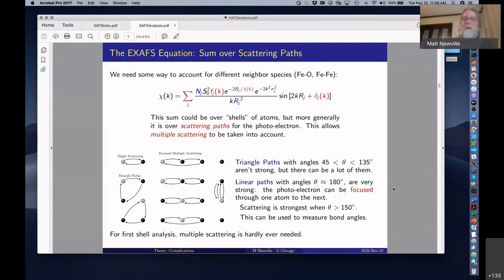And the much reduced accuracy of the absolute intensity is at least partly that normalization and overabsorption corrections or pinhole effects. All of these other experimental data processing effects, and S0 squared, which is also energy resolution of your beamline. All of those sort of conspire to make the amplitudes of mu be challenging to get right. And actually then also making the amplitude of chi to be wrong.